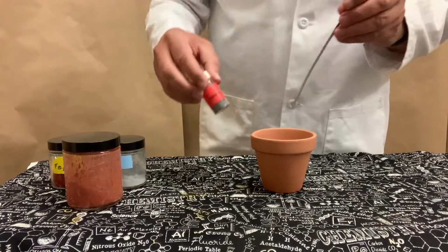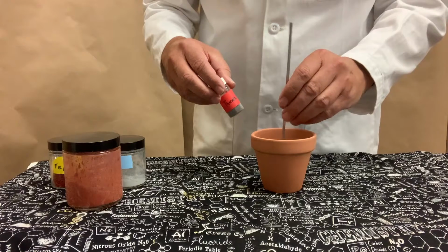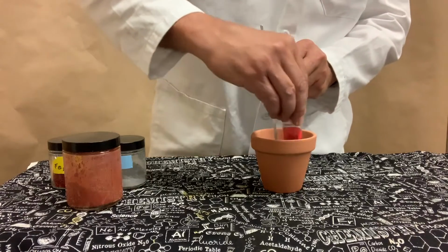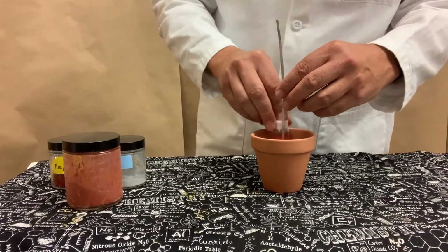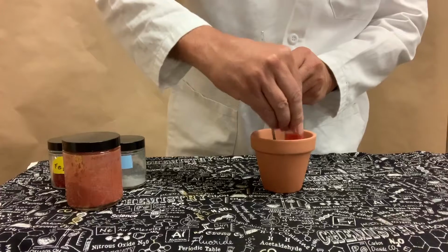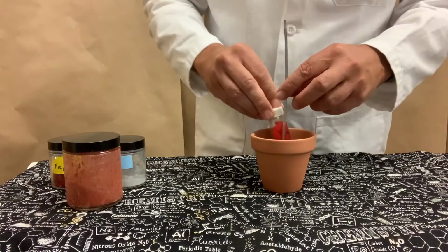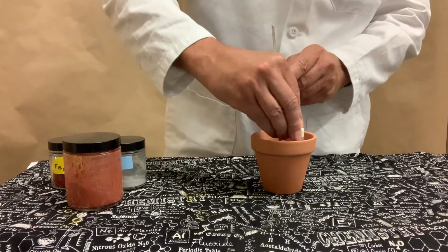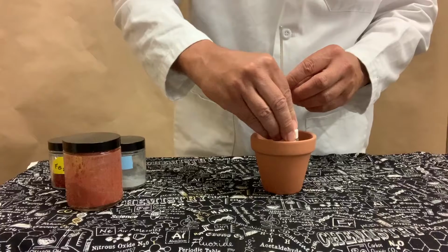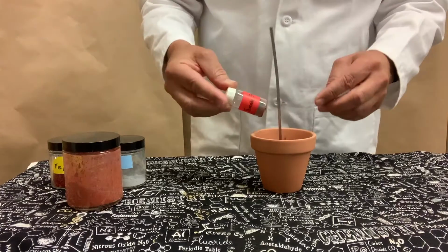So I'll start by placing the magnesium ribbon in the center of it. There we go. And packing down the thermite mixture firmly around the ribbon. There we go.